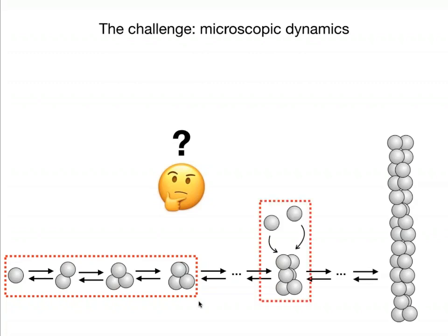The same is true if you were to ask the question, what species actually attach to a growing actin filament while it's elongating? Because in all of these cases, what you would need is a method that quantifies all the species that are present at single subunit sensitivity, and to image the whole process in a dynamic fashion.